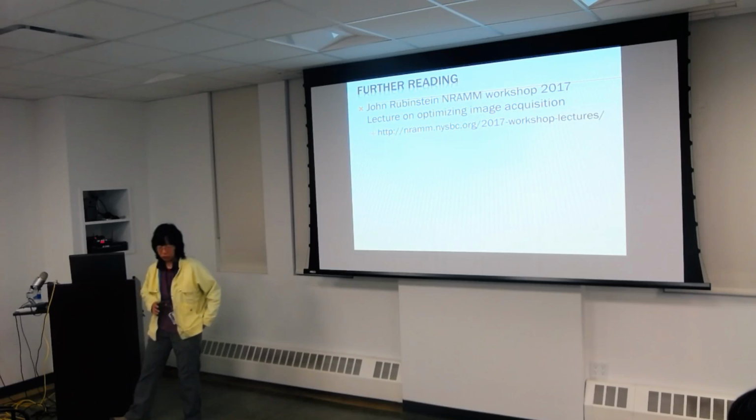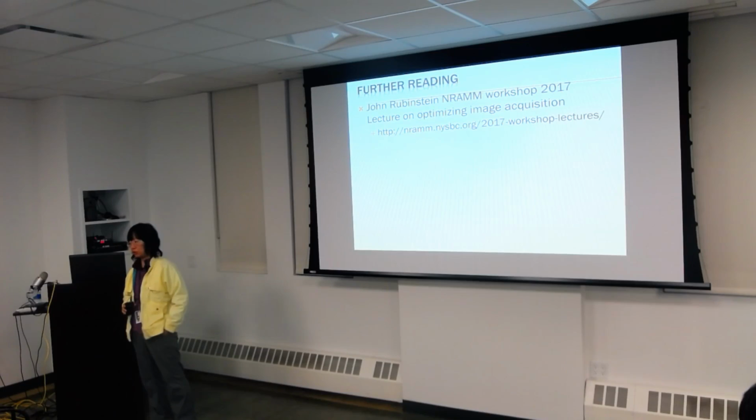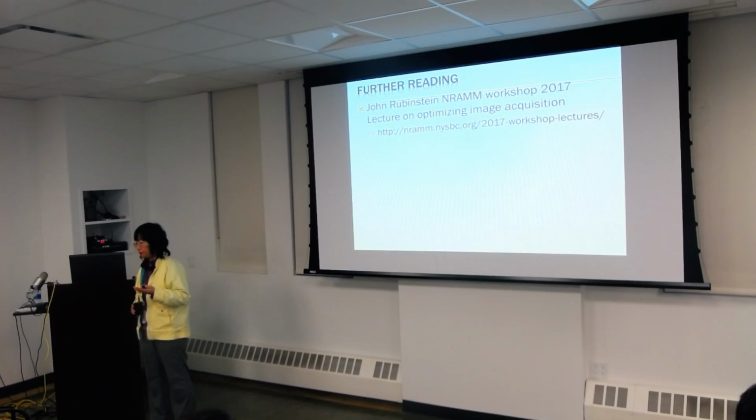Okay, so the first question you need to ask is whether you want high contrast or high resolution. The main reason we want contrast is because we want to be able to pick a particle or see features at a low resolution. Anything you are looking for in terms of contrast really is for defining your material. That's very different from searching for high resolution. So basically both methods are just as good. In general, my experience is that you can get the same result from one or the other. With phase plates, a lot of the time people say you can get the same high resolution with fewer particles. So in terms of time saving, it's a plus.